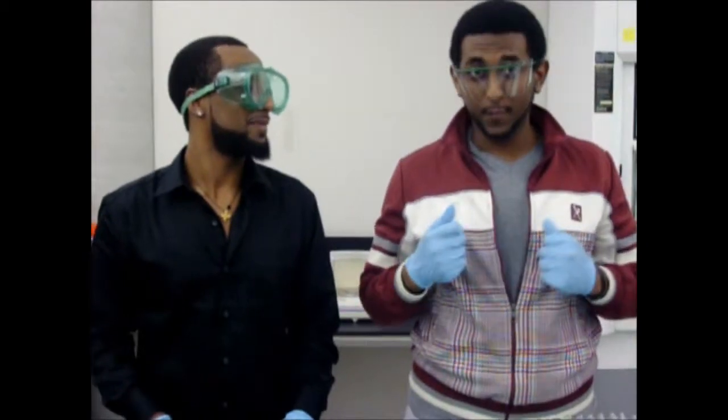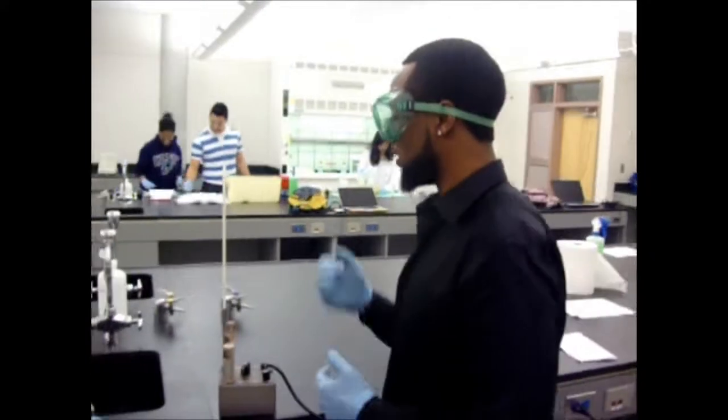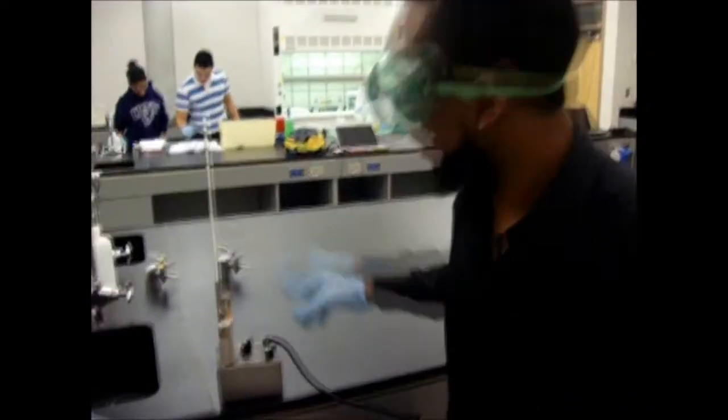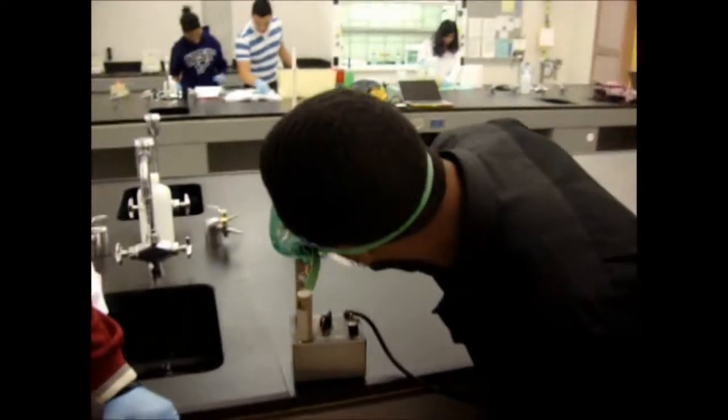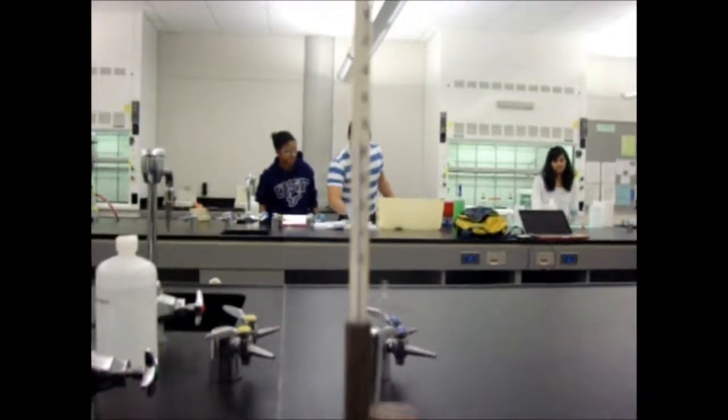Alrighty. You finished? Yes. So cameraman, if you come to the side to see where exactly our temperature range is at right now, we're starting at roughly around 34 degrees Celsius. Now we're going to increase this very slightly so that we get a very accurate measurement of where our melting point range is. So far we are at about 36 right now, and our product still is in the solid form.